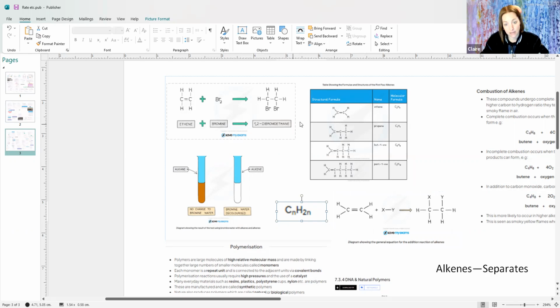You can identify an alkene using bromine. Okay, the bromine will attach and, well, unwind or remove that double bond and attach to the carbon, forming dibromoethane. Don't need to remember that name at all. And what that visually looks like, if there's no change, that means the bromine hasn't reacted. Alkanes do not have that double bond, so they are not reactive. Okay, alkenes have got that double bond, so they will react, produce this dibromoethane, and become decolorized. The bromine is always brown.